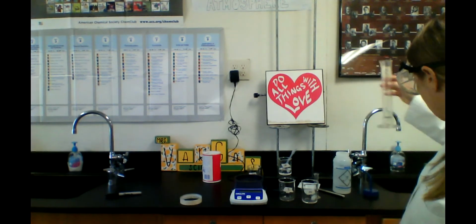Let's do our 10. Okay, so we had 8 milliliters of stock solution, so we're going to need to add 12 to get to a total of 20. So I'm going to go back to this one. Okay, and I've used too much. I'm at 15. Since I can't take out of this one, I have to make sure that I'm under.